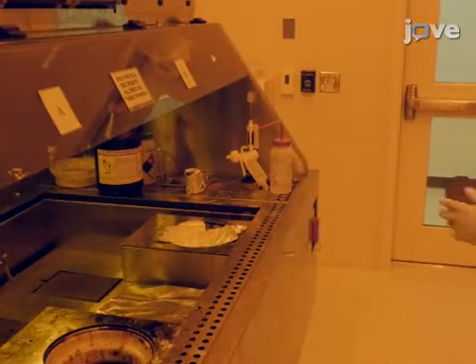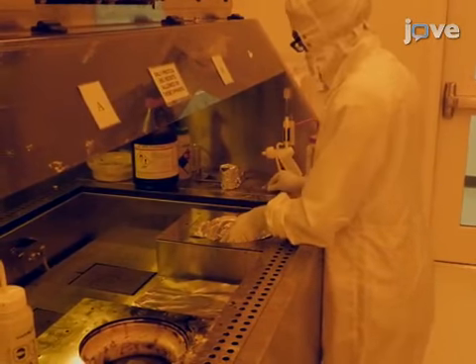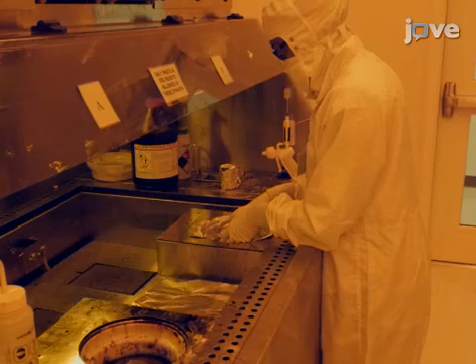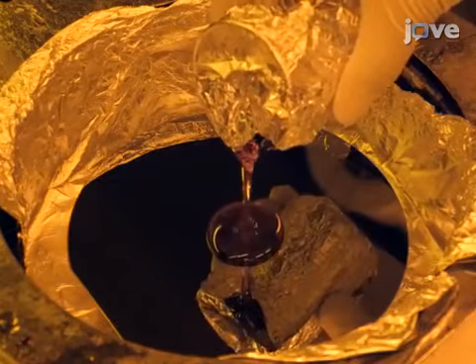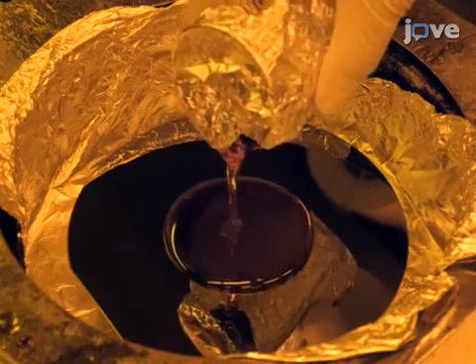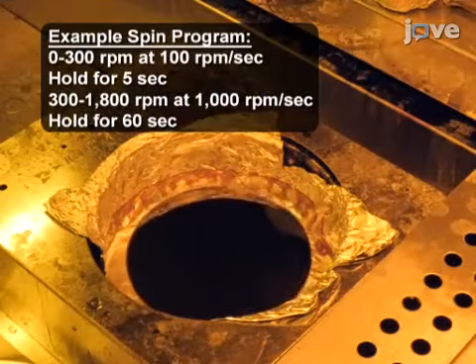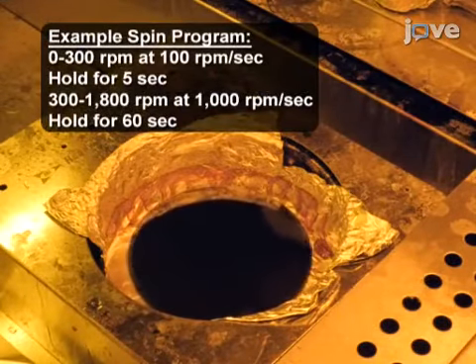In a clean room facility, place a clean 6-inch single-side polished silicon wafer onto a spin coater, polished side up. Deposit a positive photoresist directly onto the center of the wafer by carefully pouring until the photoresist covers most of the wafer. Then, spin the sample to produce an even layer of photoresist.